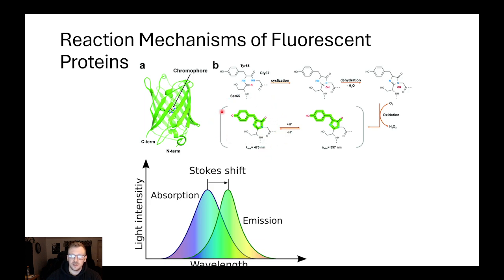So this version of GFP is what is most commonly used. You're most likely going to see this, but due to stochastic conditions in your media, you might be absorbing at 397 or at 475. So your media does come into play on the ability of your fluorescent molecule to be fluorescent. Now, at physiological pHs, you're most likely going to be in this deprotonated form. But if you're ever wondering why you're getting so much off-peak excitation, as it's called, it likely means that you have protonation differences along your actual chromophore here.